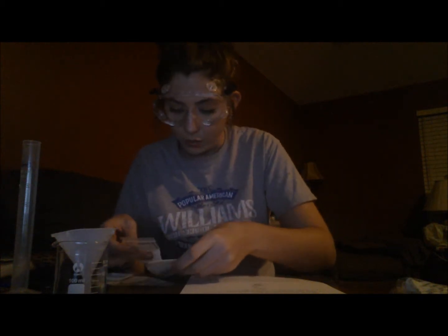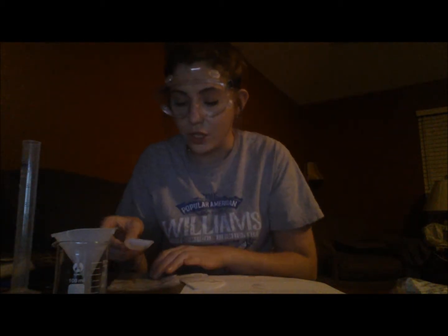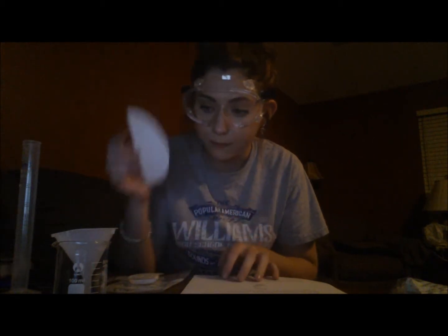Okay. So, step 1, put on goggles. Weigh out 1 gram of CaCl2. For this experiment, we're going to be using the stoichiometry of a precipitation reaction bag, which has a weigh boat, sodium carbonate, calcium chloride, and filter paper.